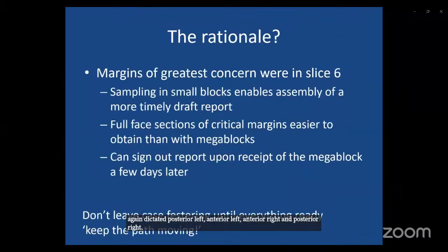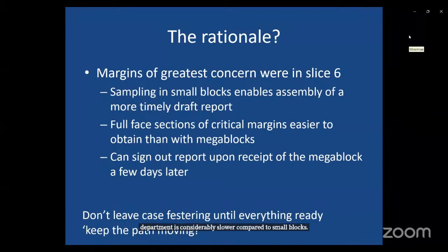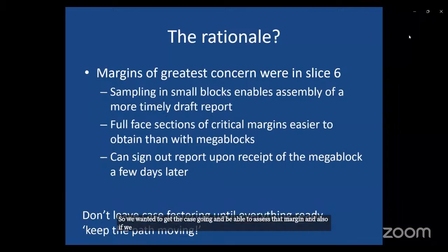So the rationale in taking a mixed small block and mega block approach to this case was we were interested in particular margins. The turnaround time for mega blocks in our department is considerably slower compared to small blocks, so we wanted to get the case going and be able to assess that margin, and also if we needed to take further deep sections for a full face, it would be far simpler to do that on the small block rather than having to wait for the mega block.